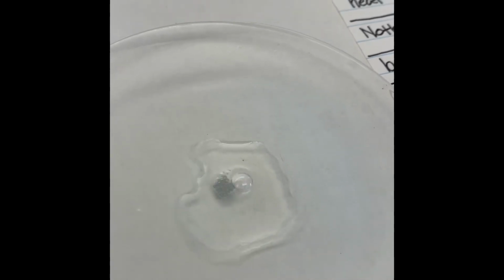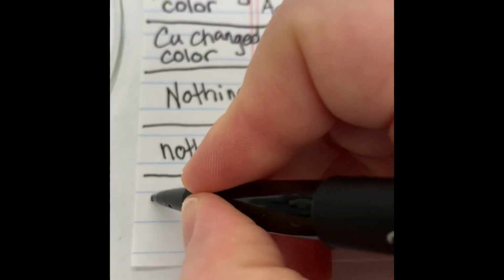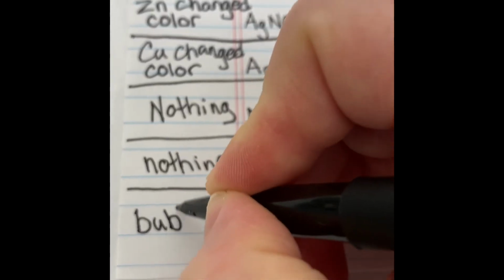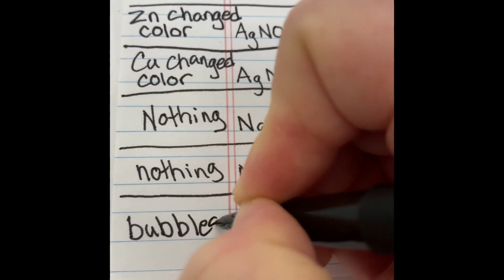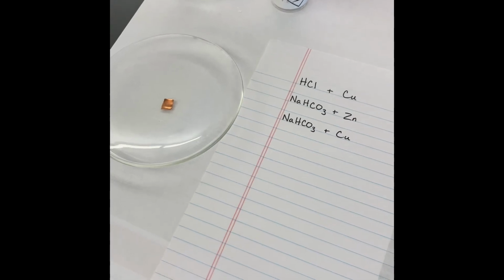Got some very vigorous bubbles. All right, almost done, folks.